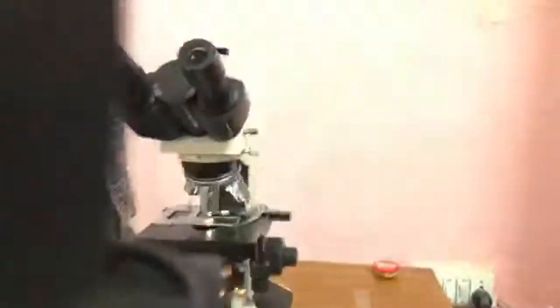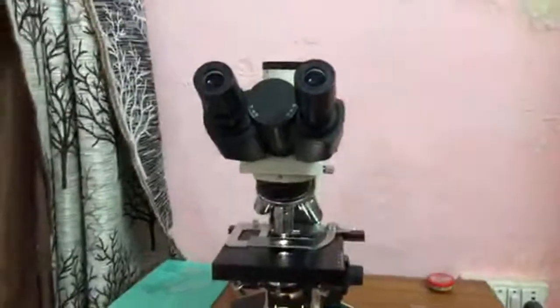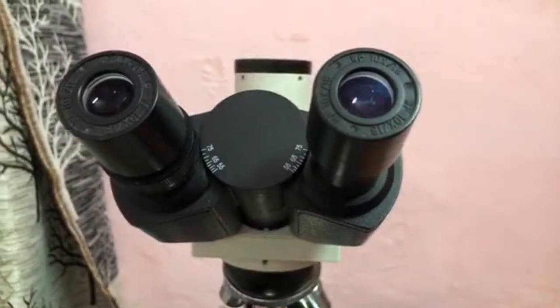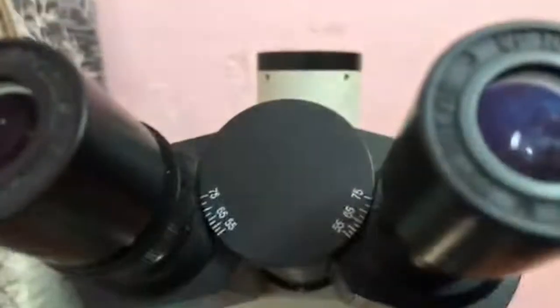So here we go. There goes the first slide. Now the second one. They are a little new, so have a bit of rigidness in them, but that's good. All right, so now that we are ready with it, I'll be aligning the lenses. It's a little tricky job, but once done, the rewards are pretty interesting. You can try this at your own home. All you need is a tripod and a microscope.